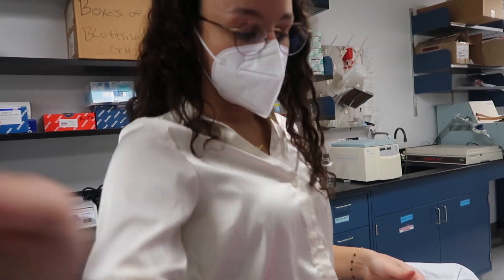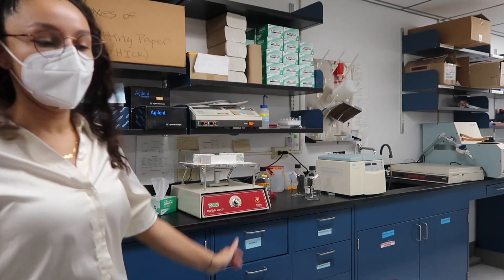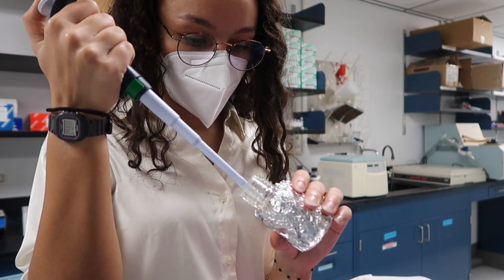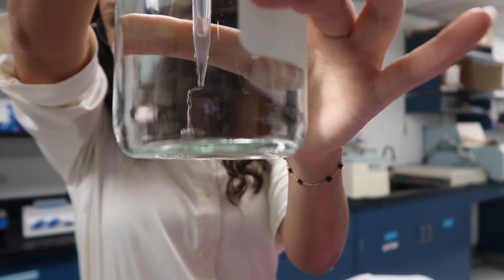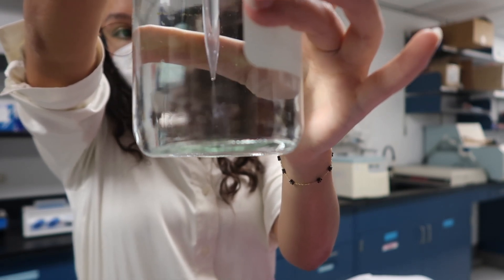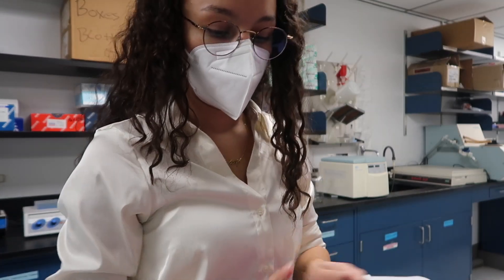Making more Tween for more washes, because today is a bunch of washes people. My secondary antibody is dancing. I also need to make more PBS but first, Tween. This one shouldn't leak because it's not broken. And then I'm just going to add a note saying 'with Tween.'